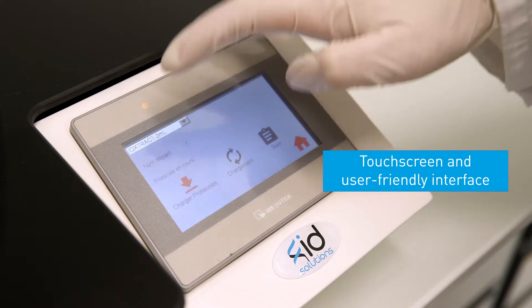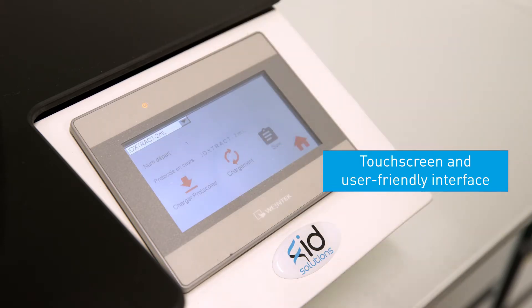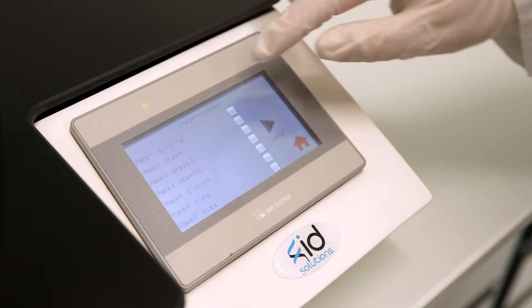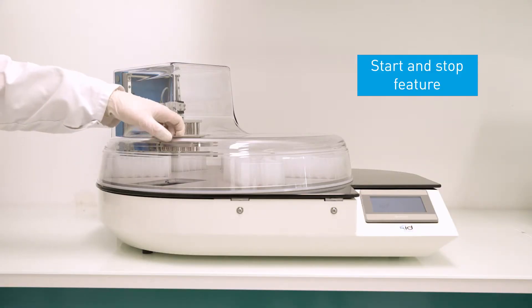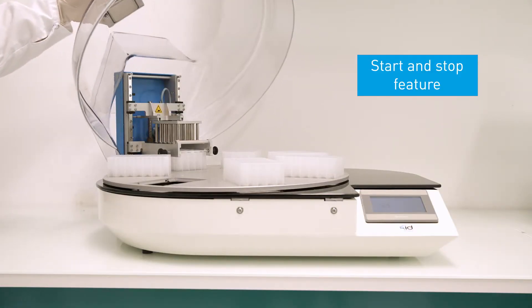The device is easy to use with a touch screen and user friendly interface. A start and stop feature allows you to resume the program if the machine is stopped.